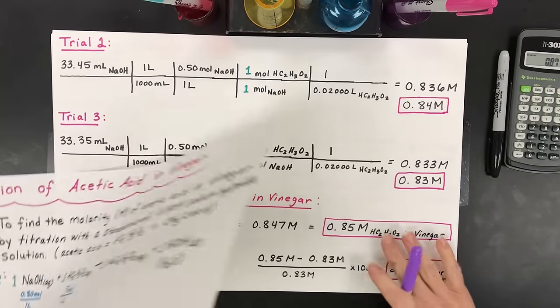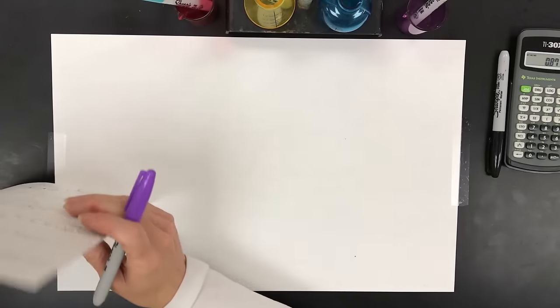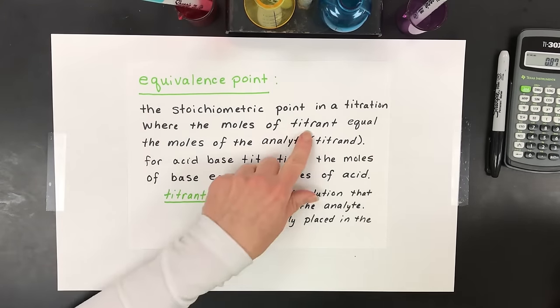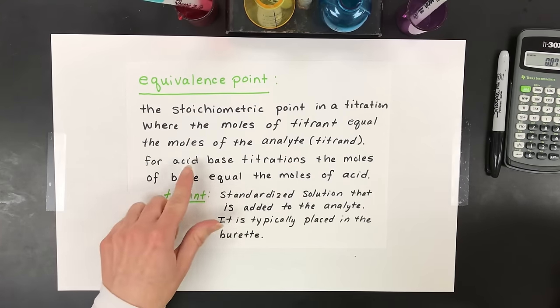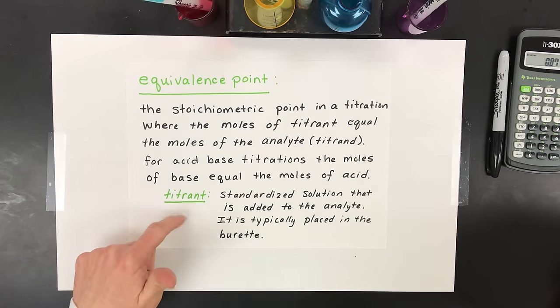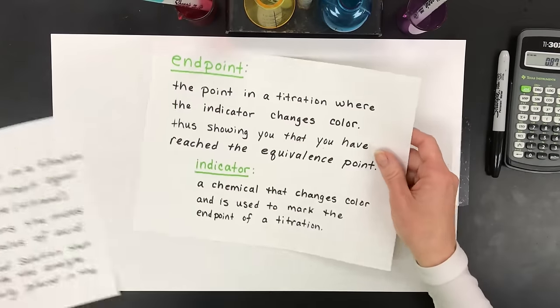I'm gonna go through two last things here, two terms that I really think you're going to need to be successful with these titrations. One is equivalence point. It's the stoichiometric point where the moles of titrant equal the moles of the analyte. In my acid and base titration, I had equal moles of acid and base, the sodium hydroxide and acetic acid. The other thing is that, again, a titrant is the standardized solution that usually we put in that burette.